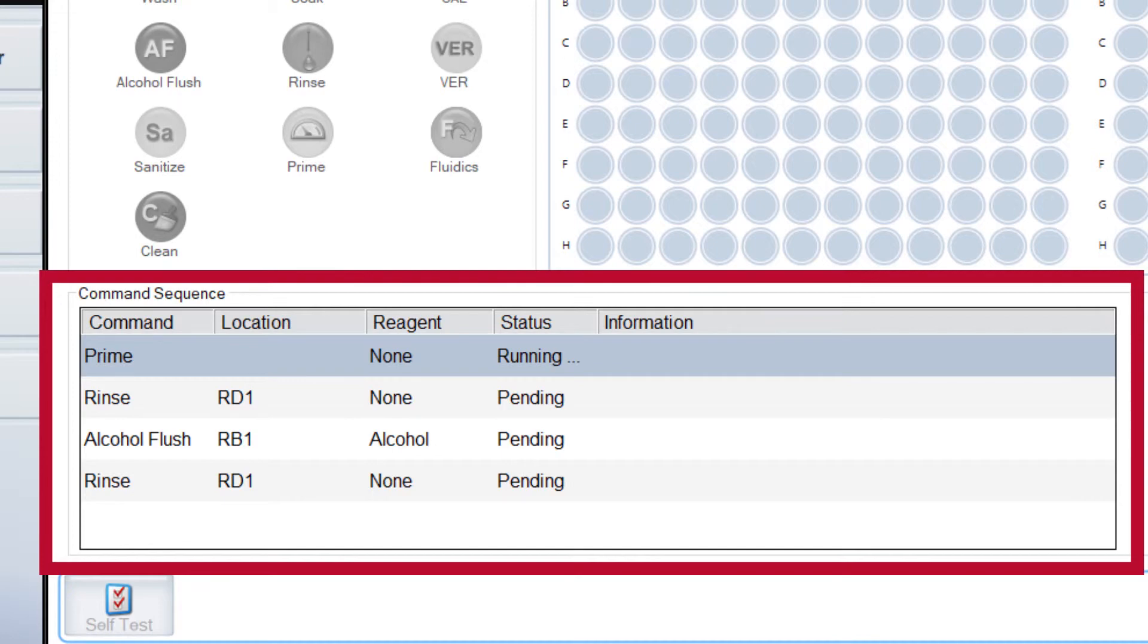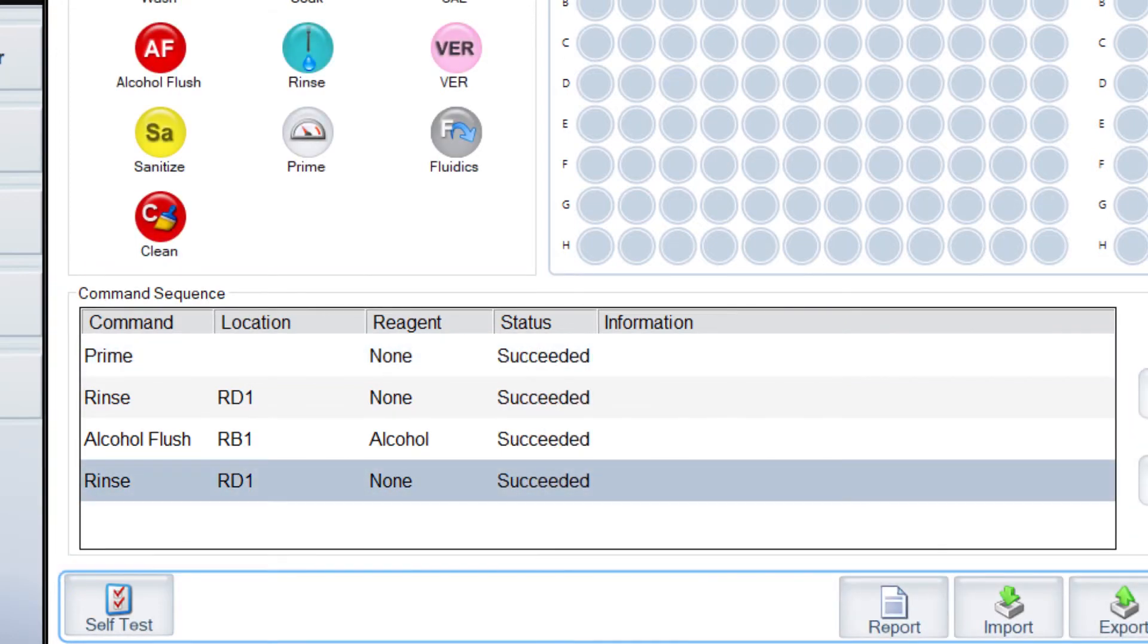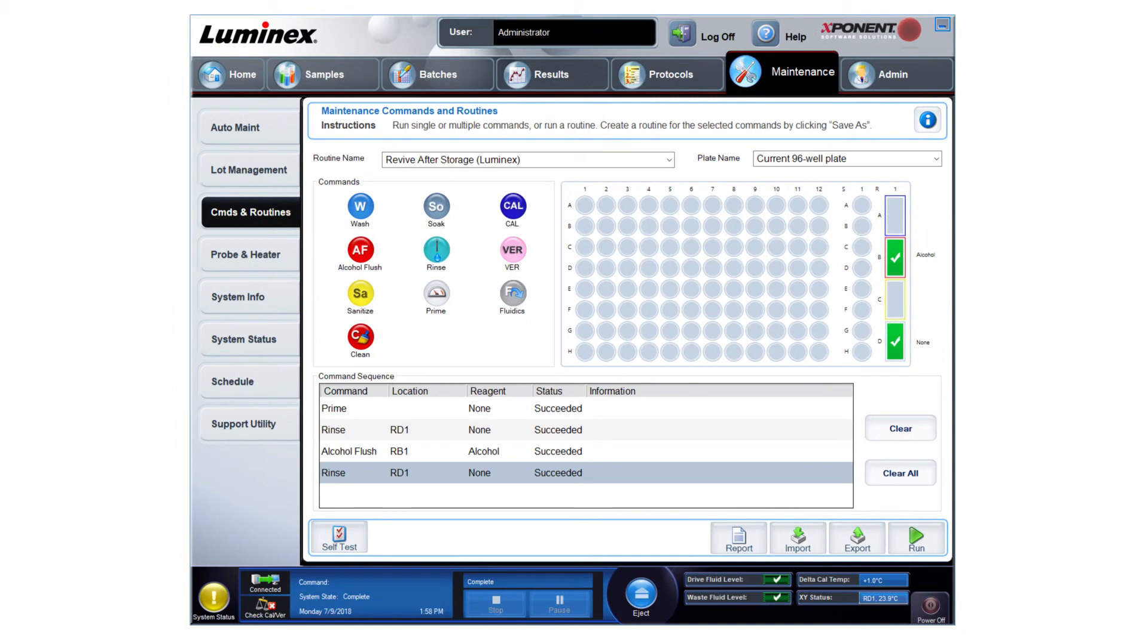This is followed by a final rinse. Green check marks and a status of Succeeded indicate the routine has run successfully.